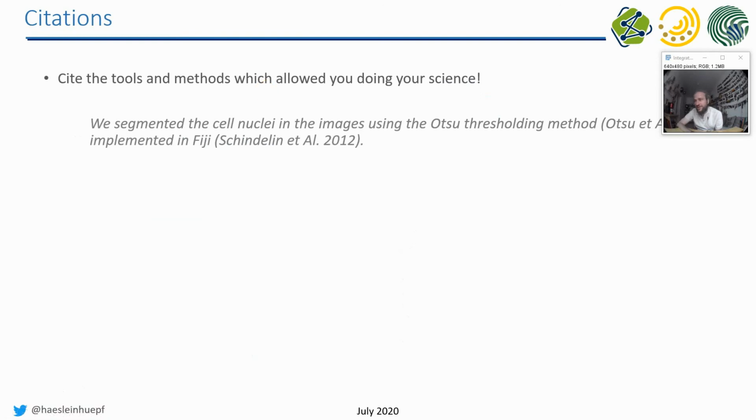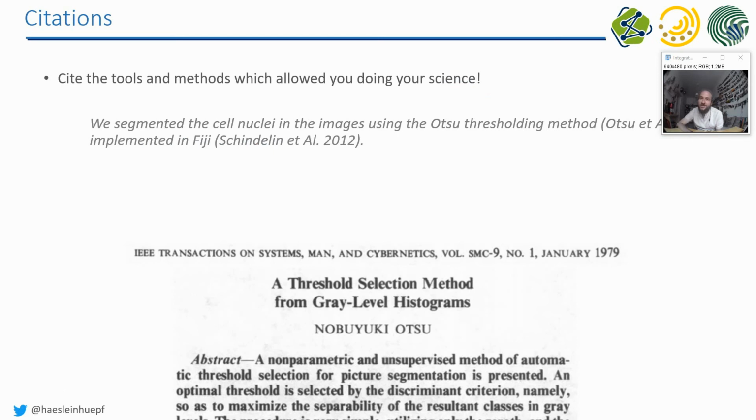And also don't forget to cite the tools. Whenever you use an open source tool, whenever you use a certain plugin, please cite the method you are using, the software which allows you to do your science. Please cite it because only in this way can developers continue developing the software, because they need citations in order to apply for funding. So please don't forget that.